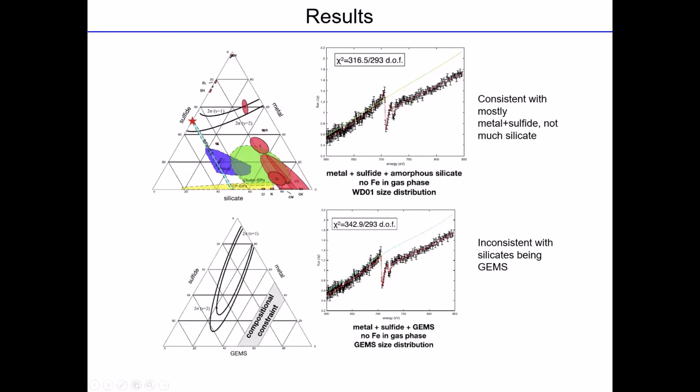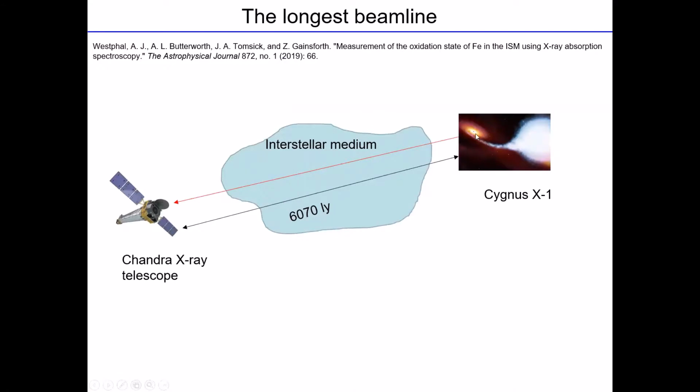Now, an interesting feature, so here's the iron L edges. An interesting feature is this little uptick. And you might ask, why would a transmission spectrum show an uptick? And the reason is that in this experiment, you're not looking at absorption, you're looking at extinction. The solid angle here is tiny, like maybe microradians. I don't have a good estimate for the source size.